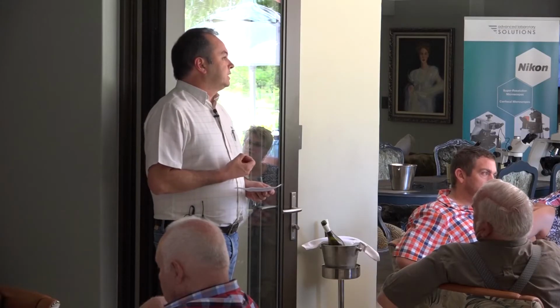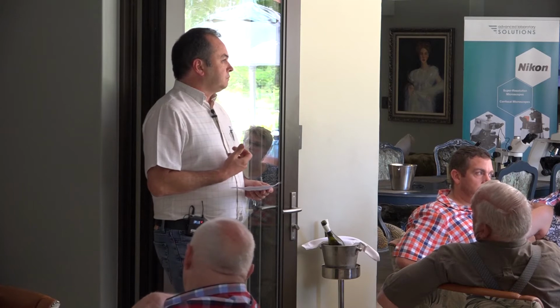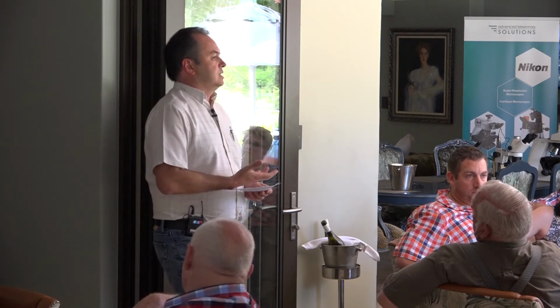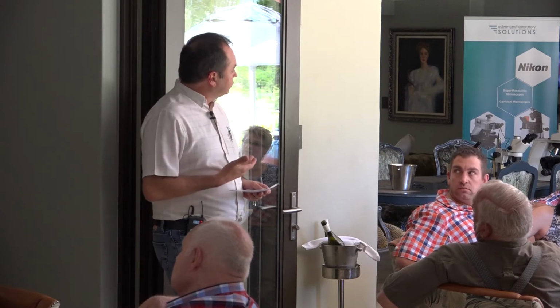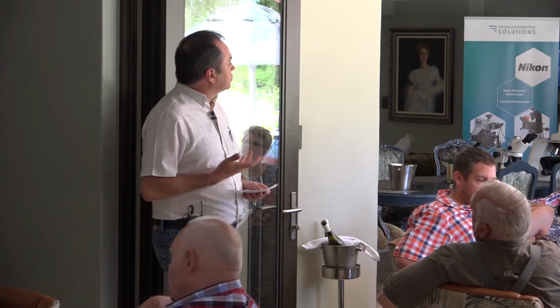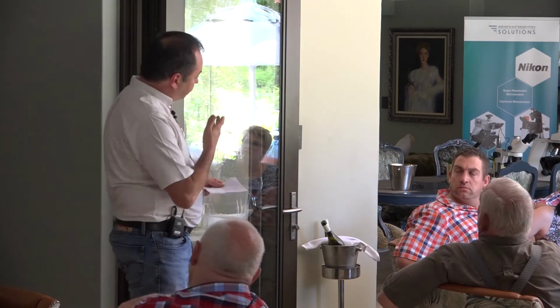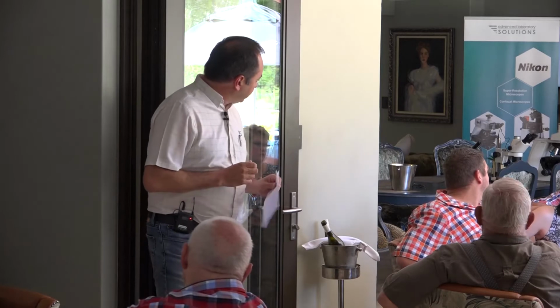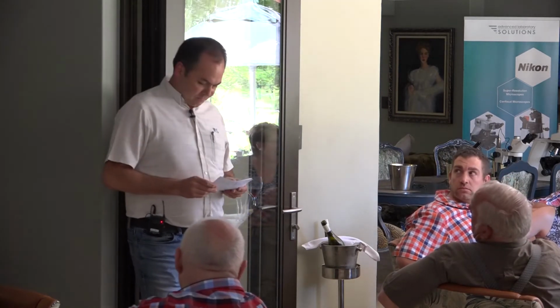Where this is useful is that some samples are transparent and you don't get much information looking at them just in bright field, whereas in dark field you get an interesting observation technique. The third one, which I have brought along here on the big microscope on the end, is something called phase contrast.